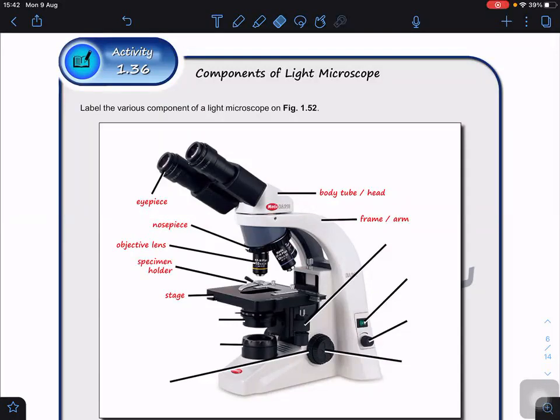So when you hold the specimen here already, we need to adjust the positions, right? You move left, right, front, back, right? You need to adjust the stage. So we do have these adjustment knobs here, we call mechanical adjustment knobs, to allow the stage to move. So the answer is mechanical stage control that allows us to move the stage left, right, front, back.